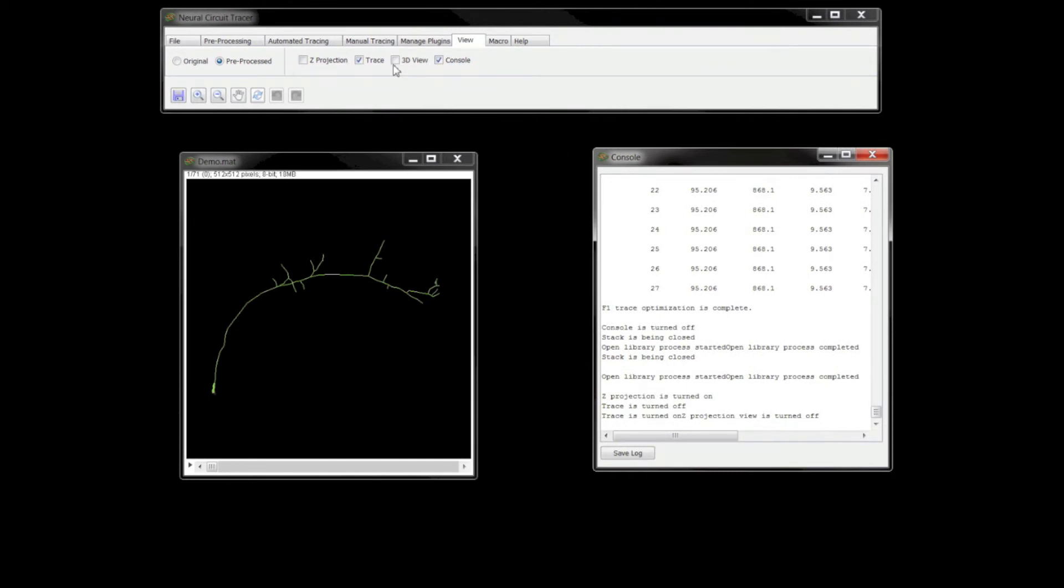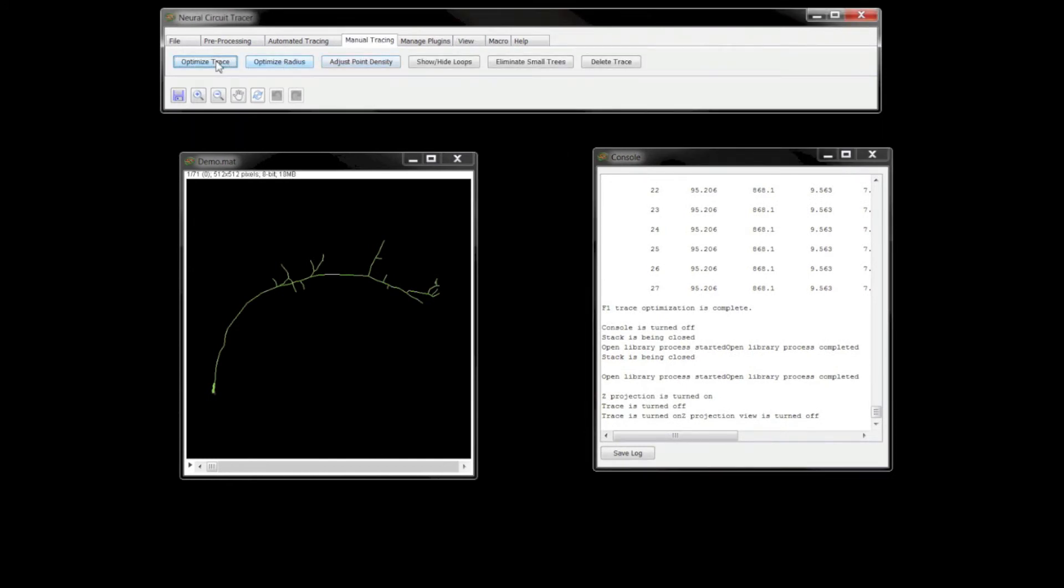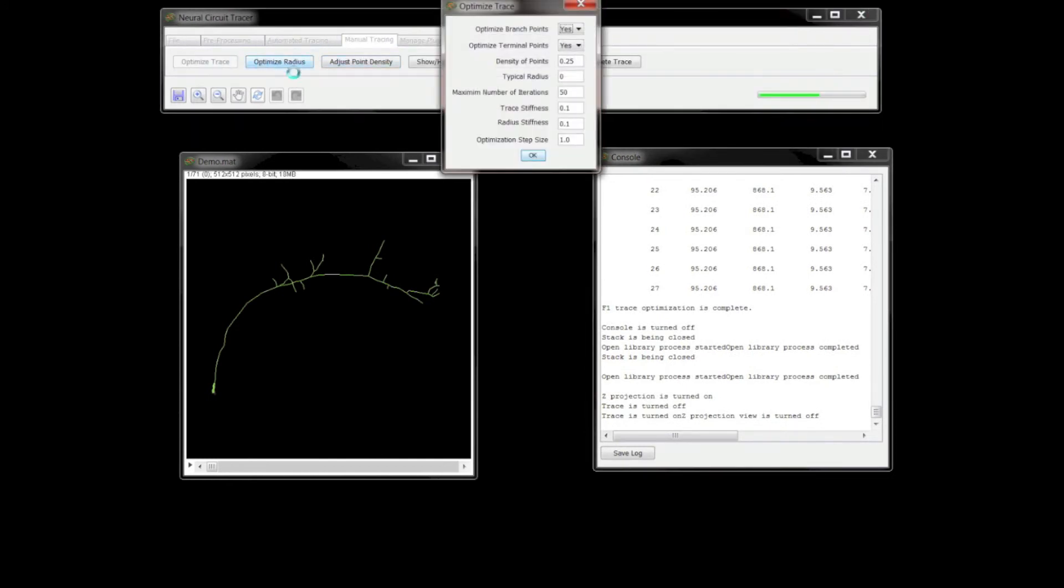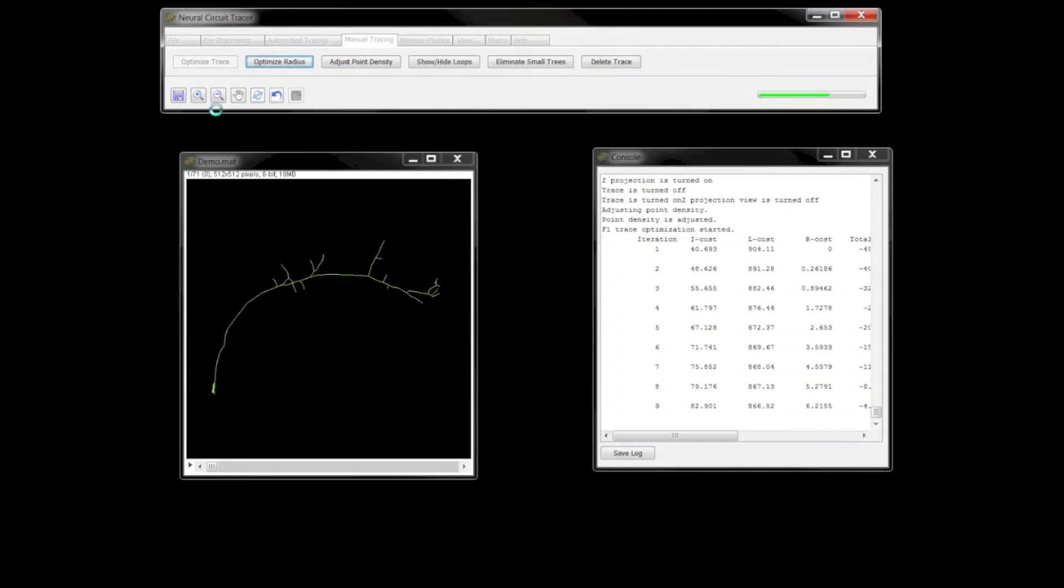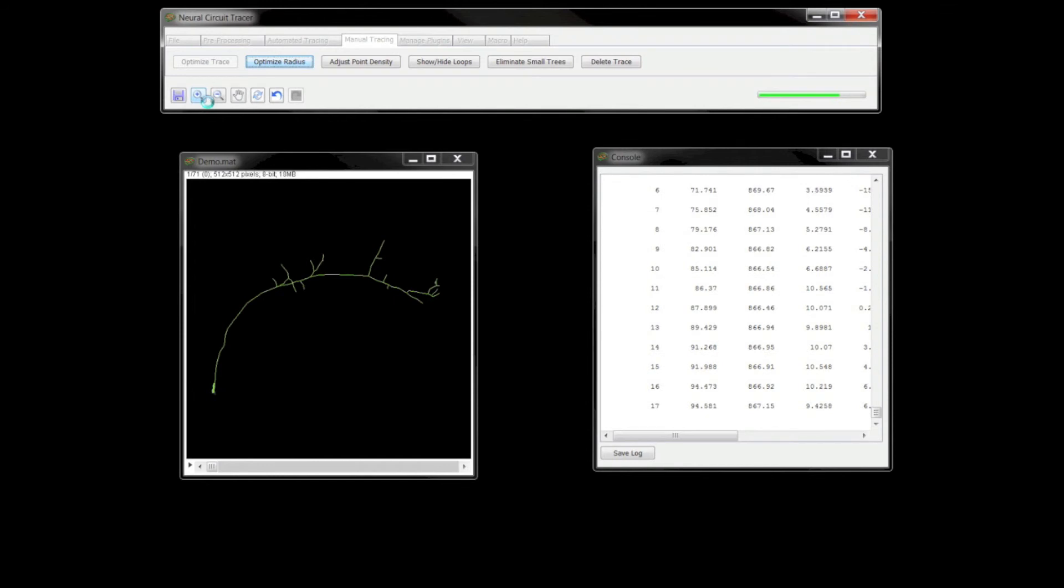The optimize trace operation allows you to fine-tune the trace based on various parameters that control point density, curvature, position of terminal and branch points, etc. I'll choose the default parameters here just to demonstrate what this operation does.